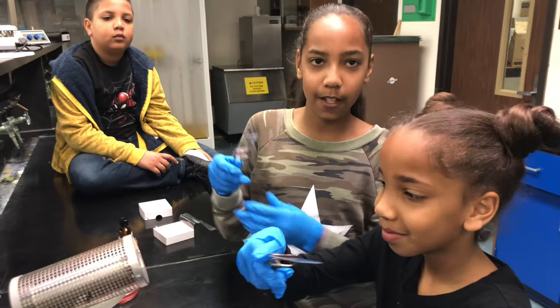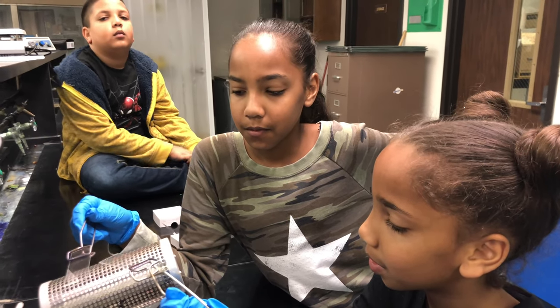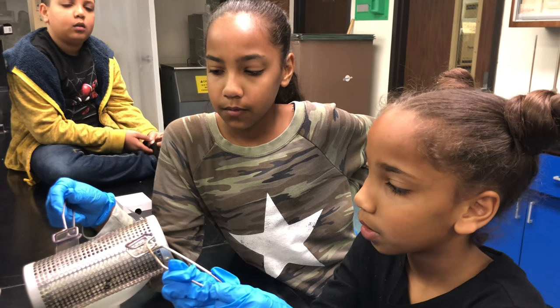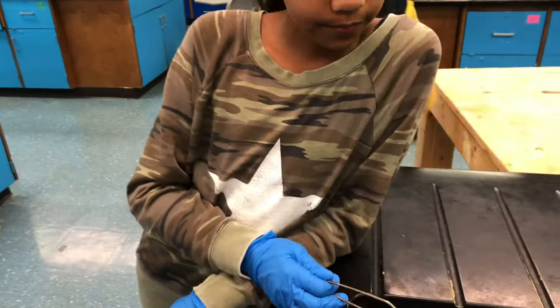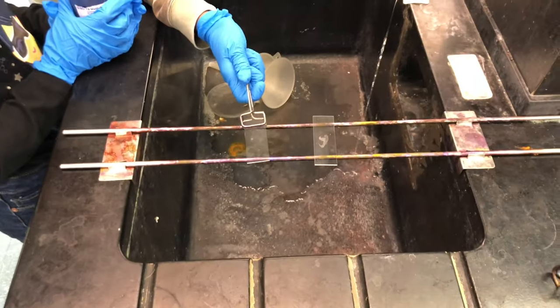It's air dried, so now we're going to heat fix it. Why do you heat fix? To sterilize it? It does kill it, but the main reason is to make sure the bacteria is stuck to the slide — if you don't fix it, when you stain it, it's gonna wash off. You can use a Bunsen burner or the bacticinerator like we're doing. Now we're going to stain it — we'll go over to the staining rack. We're using a simple stain, not Gram staining this time. Put the slide on the staining rack carefully.